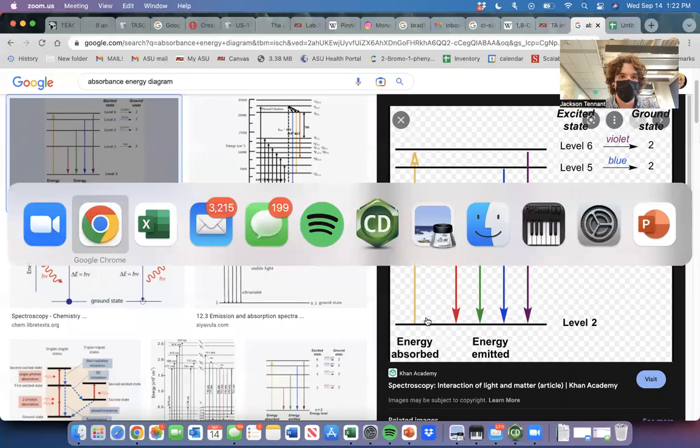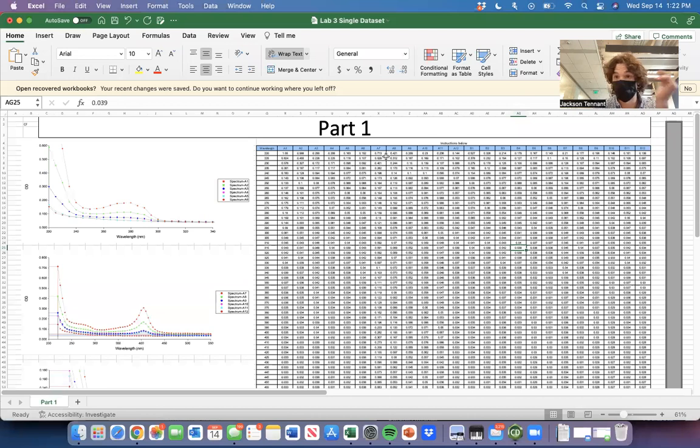So first of all, I'm going to pull this up. I'm going to be working completely out of this single data set that I sent you. This is just a combination of data I got from people that look the best, and that is going to be the easiest to work with because you're not really going to have to consider why you screwed up. Anyways, let's talk very briefly about what we did.